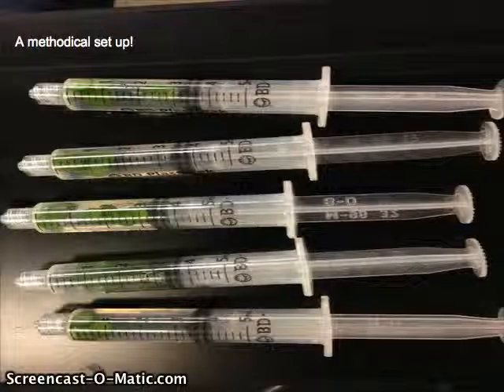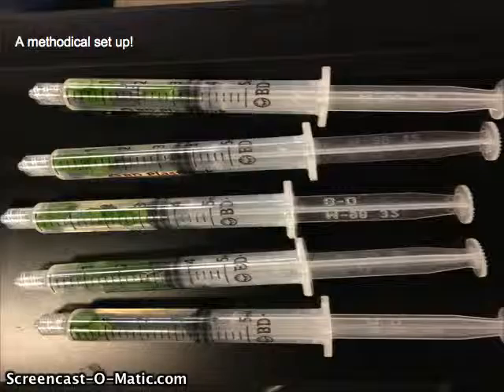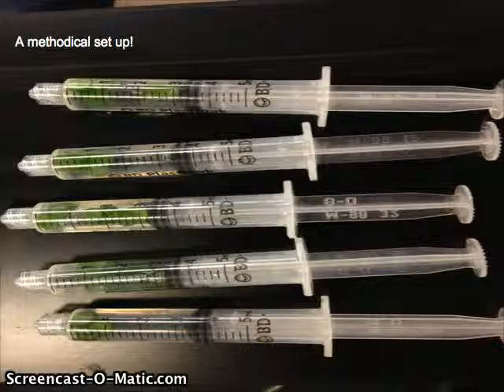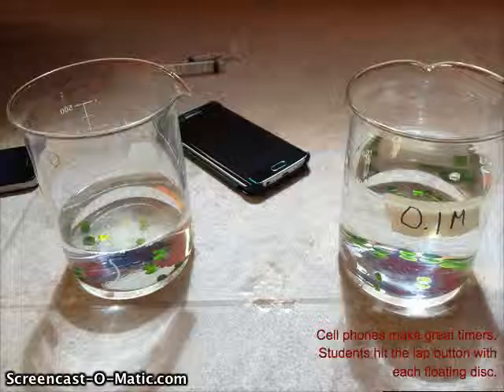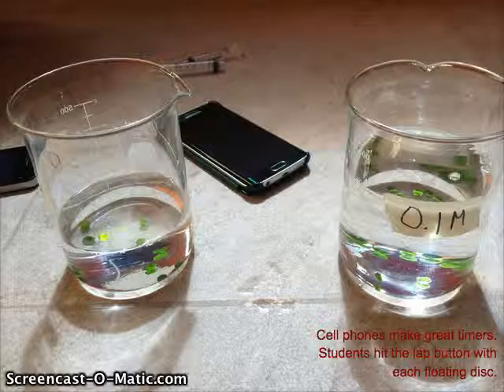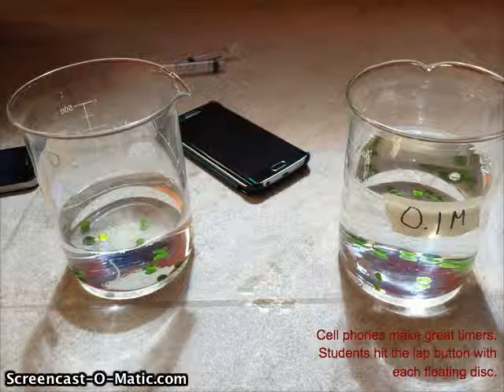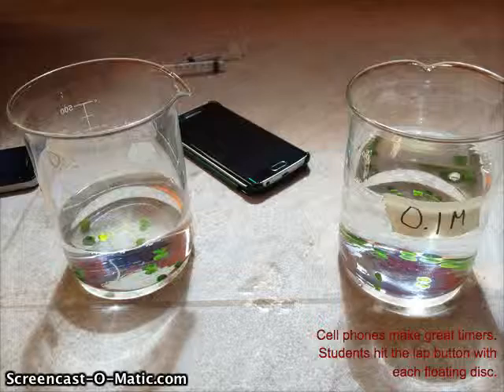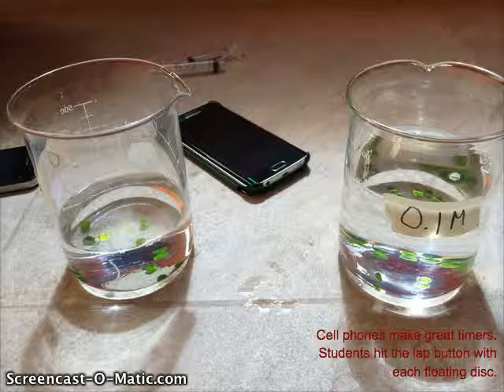and in addition, some of the student groups had a very methodical setup, almost as though it was an assembly line. Of course, the trickiest part of this lab would be getting that level of pressure and suction just right on the syringes in order to get the leaf discs to sink, but to not damage the leaf tissue itself. When I checked on the students in their sunspot in the hallway, I could see that they were making great use of their cell phone timer app, and they taught me that it's possible to hit the lap button every time a leaf disc floats, and then you have very accurate data as to exactly how many leaf discs over time were floating in the various treatments.